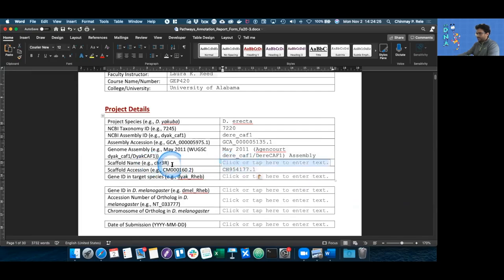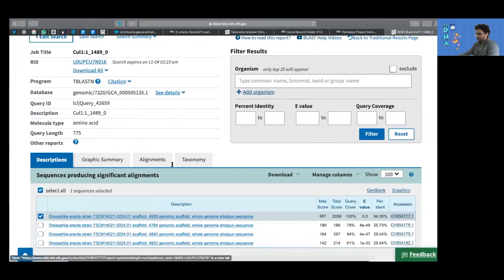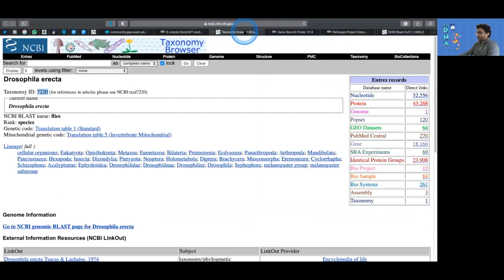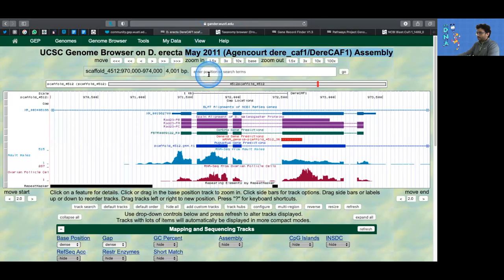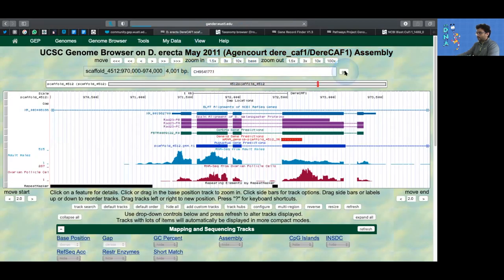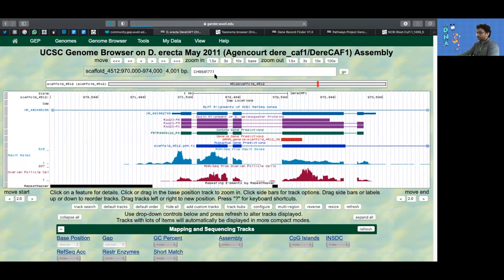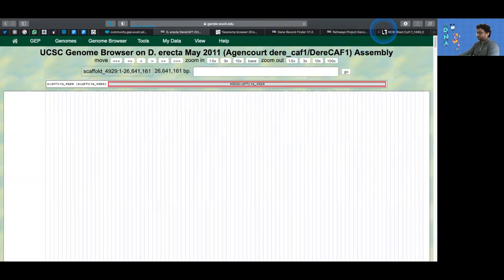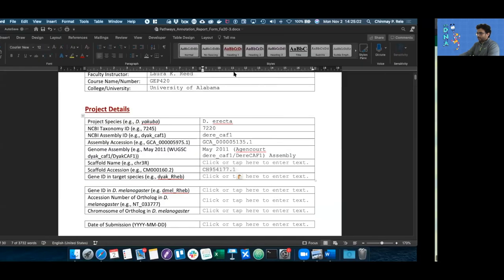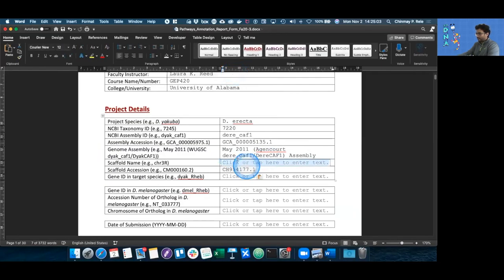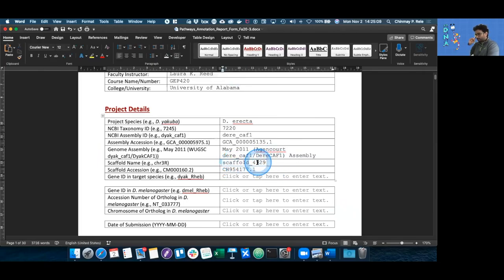And as always, keep text only. Then the scaffold name, you can get by going back to your genome browser and pasting in the accession number of the scaffold, which should take you to your scaffold of interest. In this case, it's going to be scaffold 4929. You can either copy and paste it or you can just type it in.